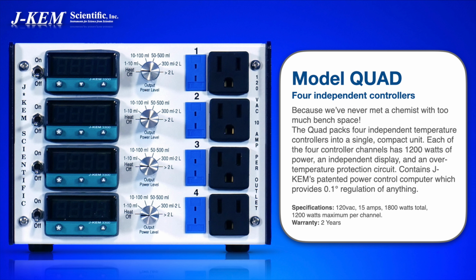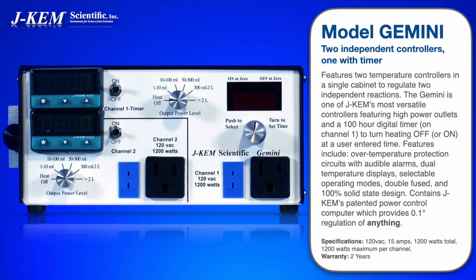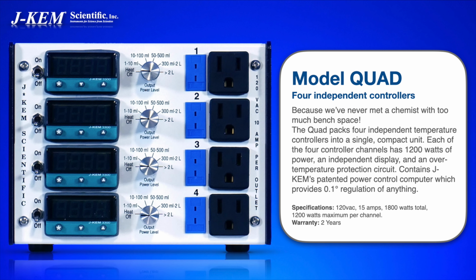If you're going to set up 4 reactions in your hood, or even 2 reactions in your hood, the Gemini, for example, is functionally a Model 210 and a 210 timer built in the same cabinet. The quad is 4 210s. It's just a matter of hood organization. It's a matter of simplicity. It's one power cord. It's just a matter of cluttering up your hood.